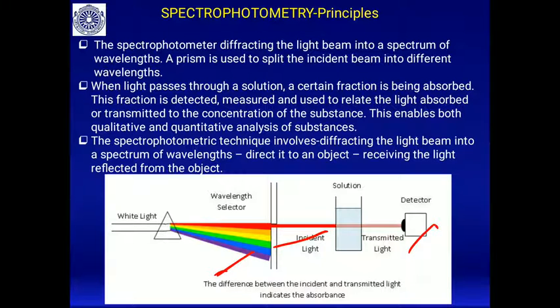It is measured and used to relate the light absorbed or transmitted to the concentration of the substance. This enables both qualitative and quantitative analysis of the substance.